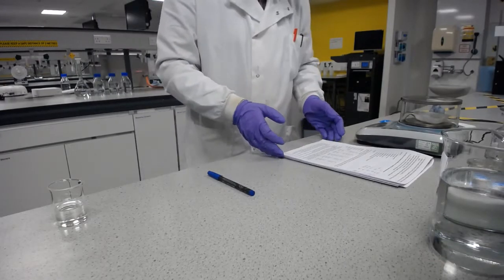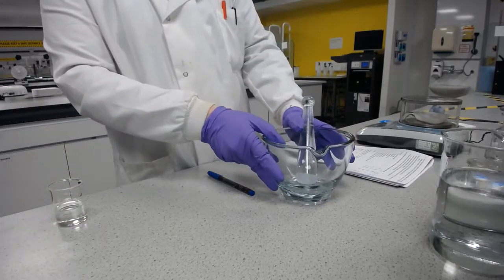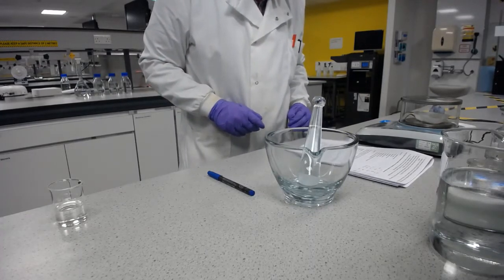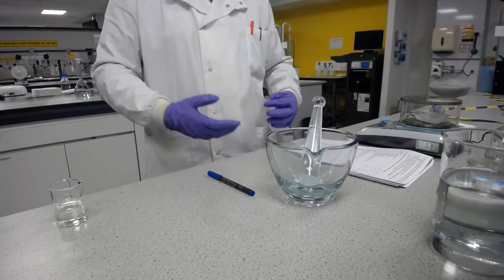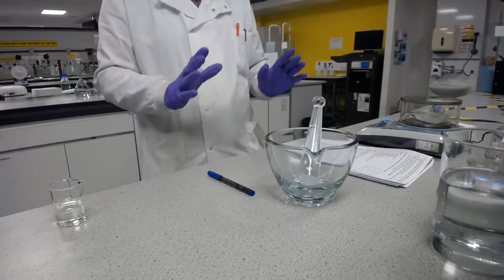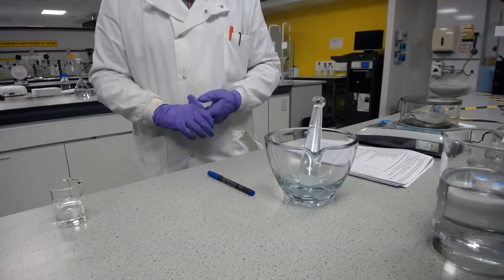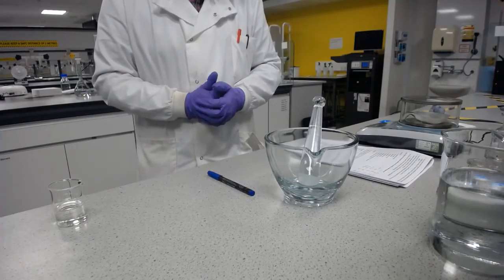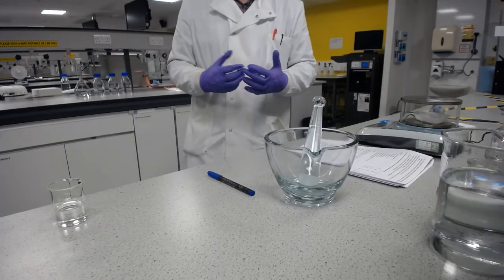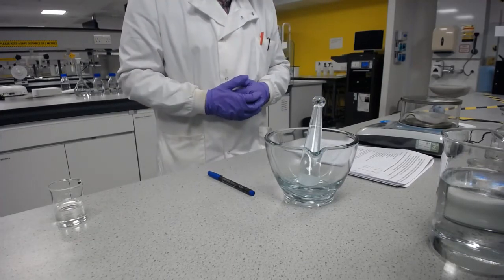So what we need to do here is weigh all of our solid ingredients, and we're going to mix them together in a pestle and mortar. That's what we're going to do. So I'll do this with the one that's got everything in for the video once, and then off video I'll make up all of the other formulations using exactly the same method, and then we'll be able to compare the different formulations to each other with the sedimentation ratio after an hour, and then seeing about the inversion tests. And we can have a little think about after the lab why it is different formulations here, whilst they haven't got anything in there to do with electrolytes, will change how fast these different formulations will sediment out.